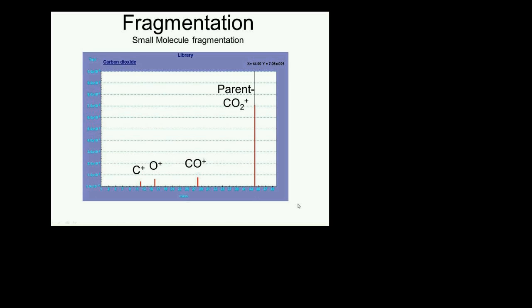And I'm going to assume that most of you have seen a spectrum. You know what a spectrum is all about. But this is an example of a mass spectrum, histogram mode, collected for carbon dioxide. So you take carbon dioxide, CO2, you hit it with electrons, and you form carbon dioxide ions at 44 AMU. But you also lose an oxygen to form carbon monoxide, and these can still cleave again and form carbon and oxygen ions. So all of these ions show up in the spectrum. So when you put CO2 gas in a chamber, you don't just get a single peak at 44 AMU for carbon dioxide, you also get these little fragments.